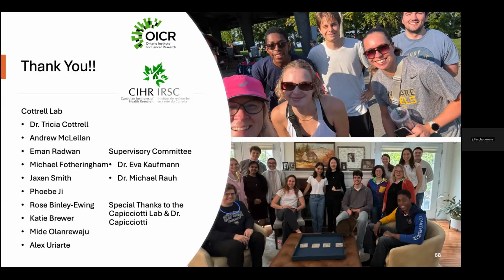I'm curious about using, go ahead. A quick question. So, when you're segmenting the cells that don't have any of the other markers, why is it important to segment those cells that don't have any of the phenotypes that you're looking for? Like I'm seeing about the one image where there's an area of cells without any markers. Why is it important to even know that those cells are existing down there?